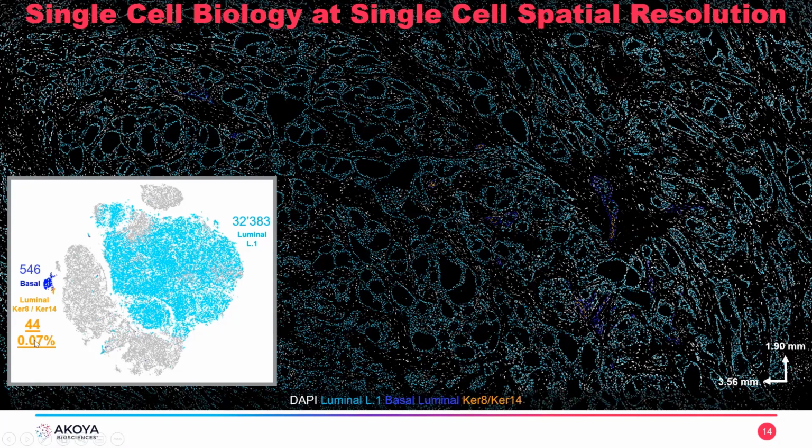It's like, what is this? Why is this noise here? How can I get rid of this? Fact is, I could not remove these data from my clustering algorithm. It didn't matter how much I constrained the parameters. Somehow, these cells always showed up in my output. I didn't ask to see these cells. I don't know what these cells are. They just presented themselves to me. I was following the data, and here we have a tiny little population of 44 cells that I spend a lot of time looking at now.